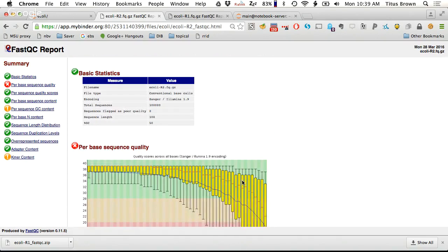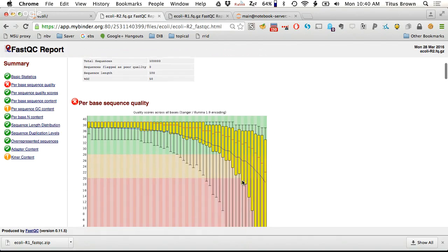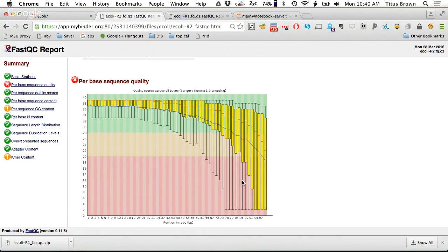Okay, so this is for genomic DNA. This is the kind of thing that you would expect to see. I think for decent quality, there's not a lot of contamination or weird stuff going on in this data set, but the quality is not that great. So, okay. Are there any questions at this point?